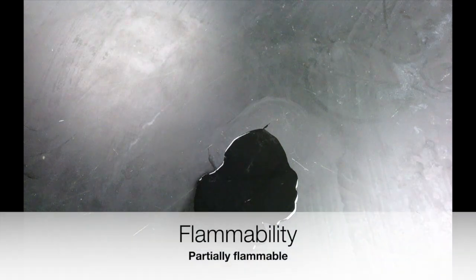It does seem like the flame stays lit for a little bit longer, even though it's small. When we turn the lights back on, we see that there is liquid still left on the table, which likely means that the ethyl alcohol burned away and water is left on the table.